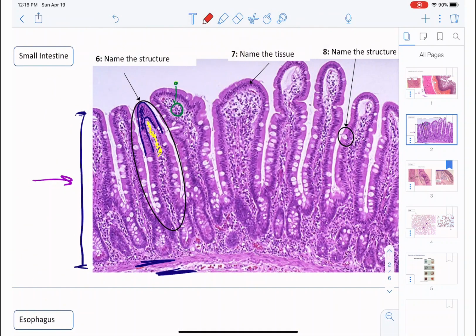Those blood vessels that are traveling through the submucosa, when they get to where they need to go, they take a right turn, they make their way up this mucosa, and they thin out and become capillaries. So this is where we have capillaries that are going to absorb nutrients from the digestive tract.